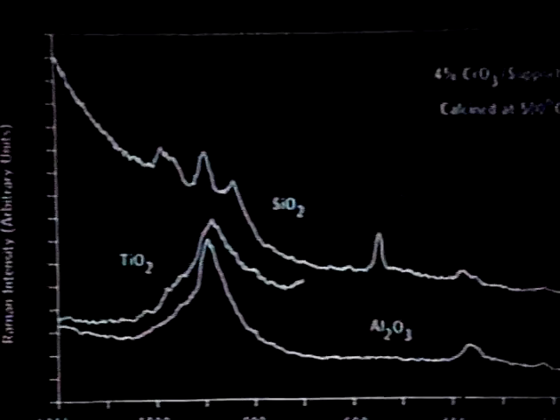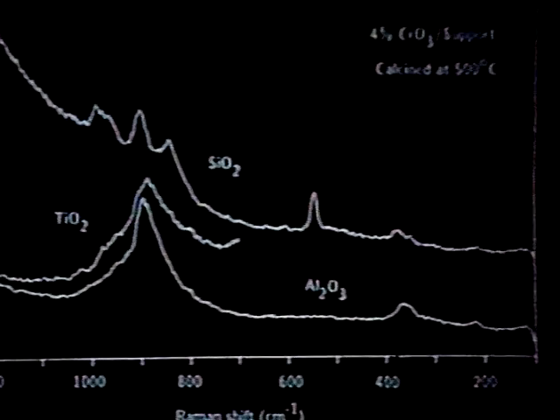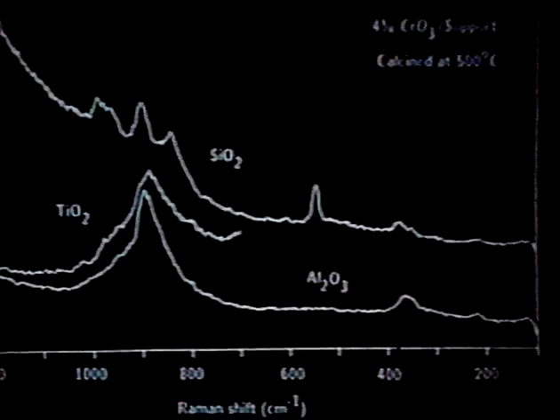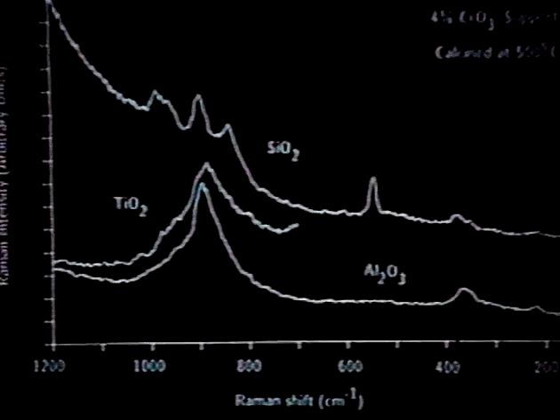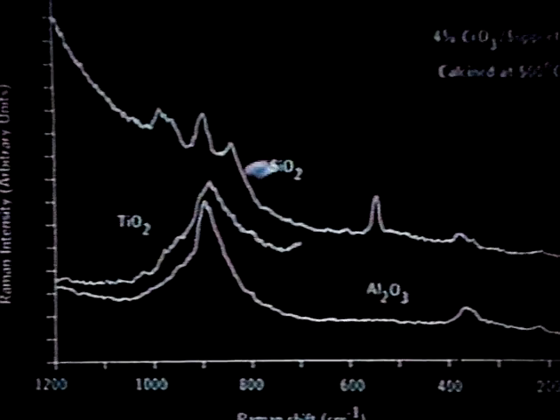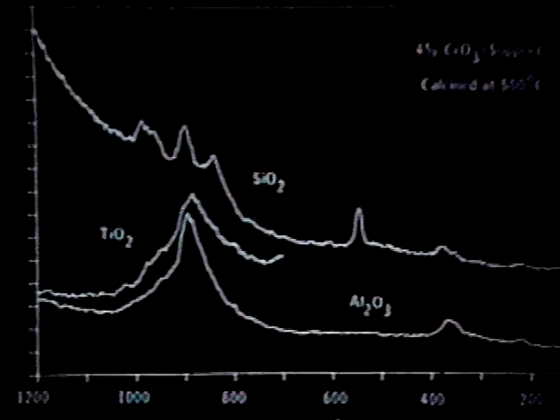Furthermore, when you go to about 3% chromium oxide or above, this band starts to grow. This is out of the crystal, Cr2O3. And so, unlike the aluminum and titanium supports, chromium doesn't spread very well onto the silica. Part of it does, the first about 2.5%. When you get to 3%, the band starts to grow. So you have both surface phase of chromium and the crystallite.